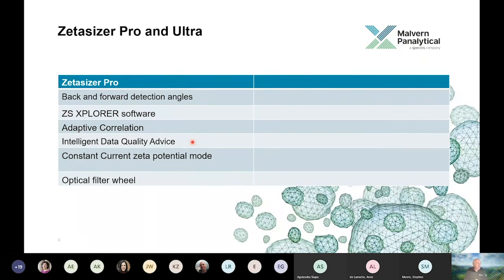And the other filters we've got on that wheel are polarizer filters. So if we are dealing with particles that are non-spherical or high aspect ratio particles, we may see a rotational component being detected. Remember that in dynamic light scattering, we're looking at translational diffusion processes. Normally rotational diffusion, and all particles and all molecules spin, they rotate as well.